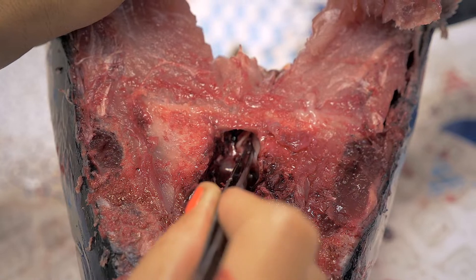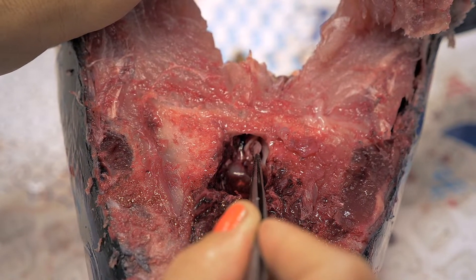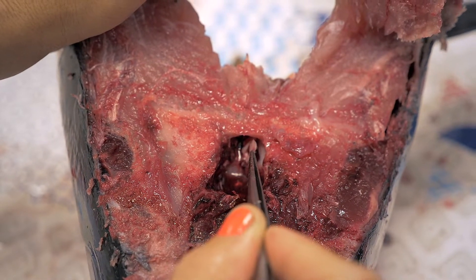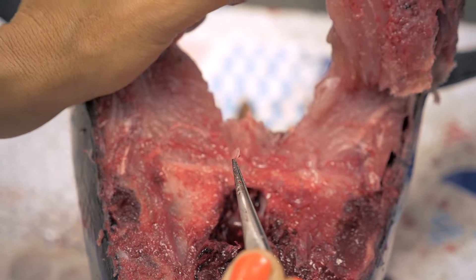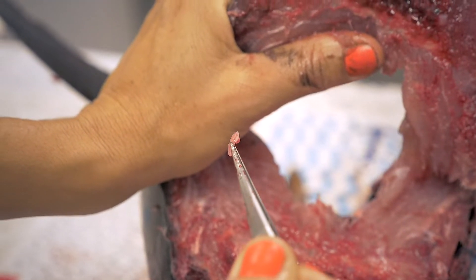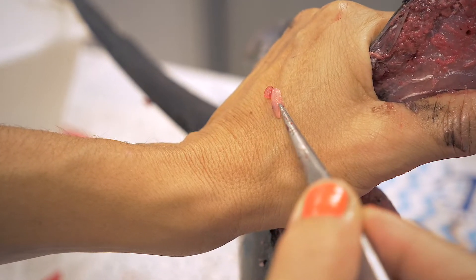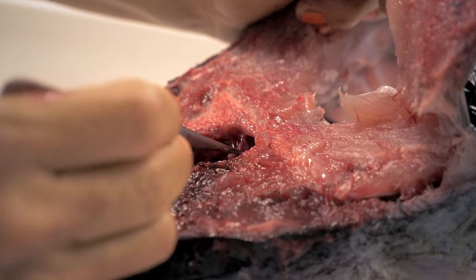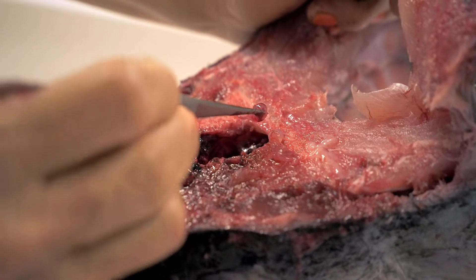Go gently, very gently to remove the otolith. You pull and then place the otolith on your hand. Do the same thing on the other side because you have two otoliths and they are on each side of the brain.